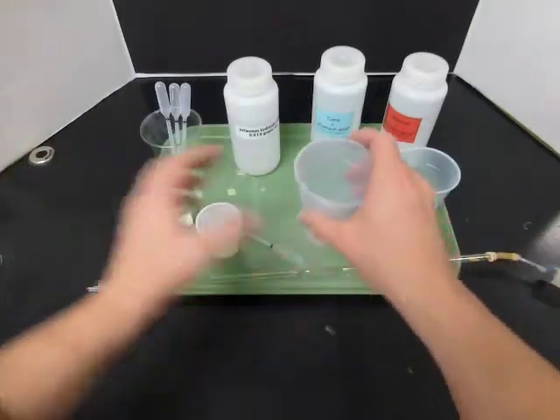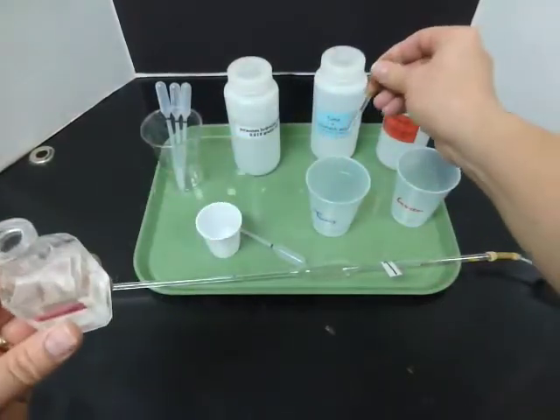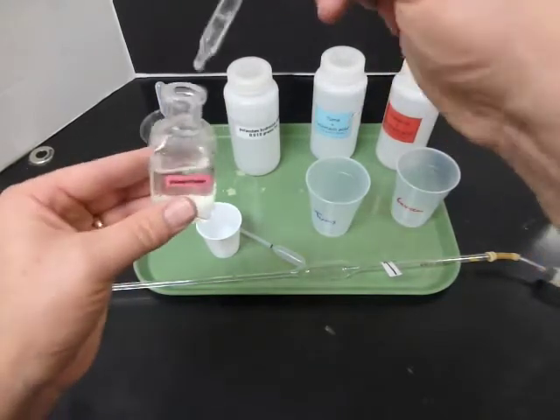You also need the phenolphthalein color change indicator. This is the one that tells us when you've used up all of the acid in the mixture. 5 drops. 1, 2, 3, 4, 5.